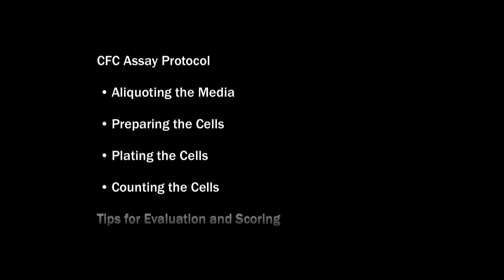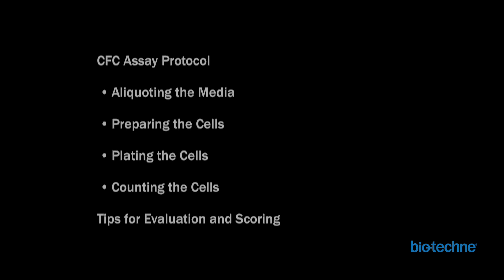The goals of this video are to provide researchers with the basic methods to consistently perform the CFC assay, as well as useful tips to accurately score hematopoietic stem cell differentiation and proliferation. This will be accomplished by first briefly walking through the CFC assay protocol. The second portion of the video will show data examples and present tips on how to evaluate and score the various cell types grown using the assay.